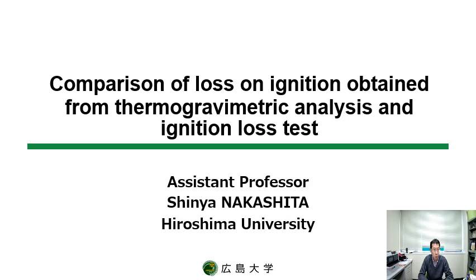I have a strong relationship with Pukyong National University. I have visited Pukyong National University more than 10 times, and I have been conducting collaborative research with Professor Kim Kyung-hee there. Today, I'd like to introduce my research results online. My topic is a comparison of loss on ignition obtained from thermogravimetric analysis and the ignition loss test.